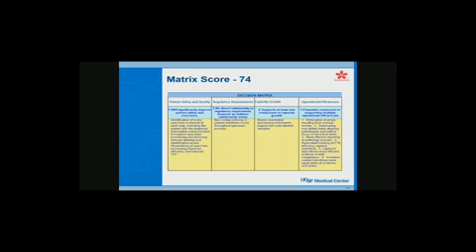Maybe you have to do much more extensive justification. It may be quite different. But this decision matrix comes out like this in this grid, and they score it. I'm not sure how they came up with a score of 74. 100 is perfect. In other words, they buy it for you right away. Anything above 70 is good and goes on the list for capital approval.